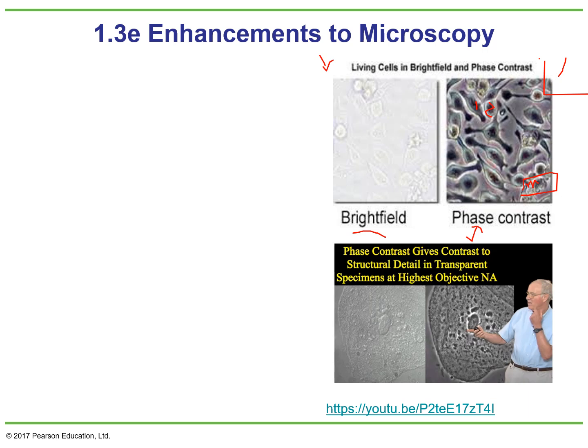So this is very useful. The same thing happens with DIC, which creates 3D pictures. If you want to know more about that, again, here is one of the world experts. The idea is that this technique cannot be used alone. You should compare it with other techniques, since each one has its own limitations.